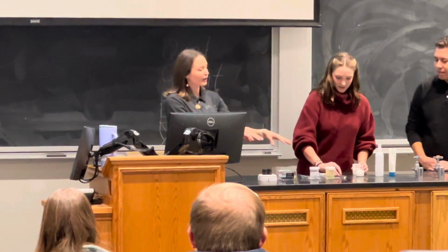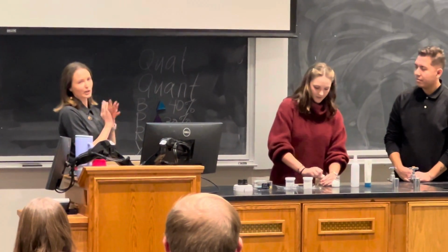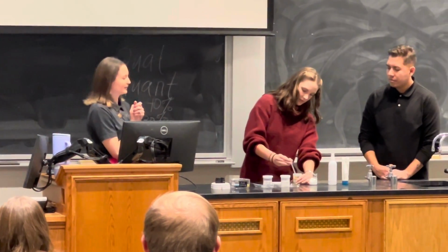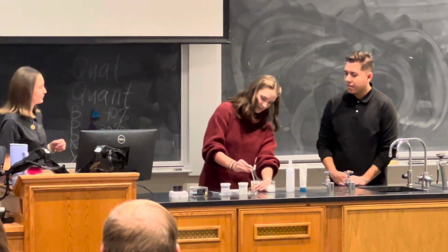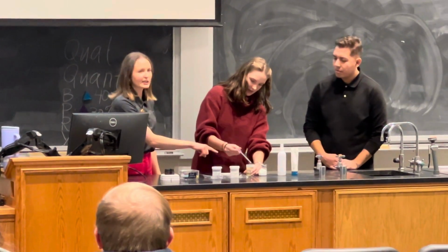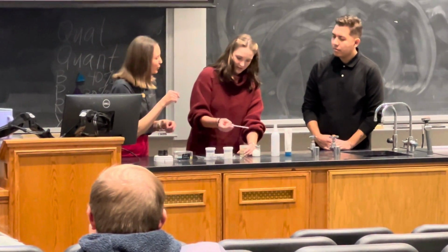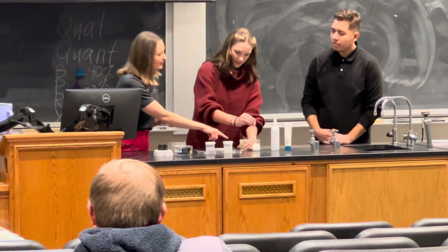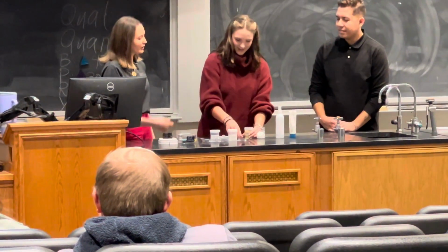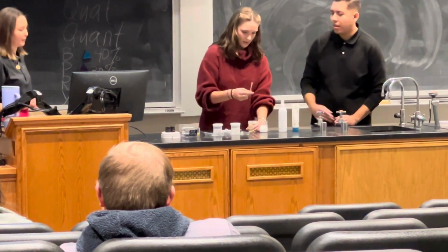These raw materials are actually left over from a validation of Daydream Protection Cream, which is a NuSkin SPF lotion. For that one you might want to use this one. Octocrylene is super viscous, so when you try to use a pipette, it kind of gets clogged. It's hard. If the transfer pipette's not working, you can use the spatula. Just take a little bit on the spatula and kind of shake it off. You can use the other side.